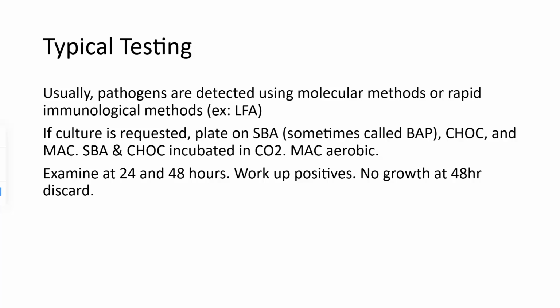The sheep blood agar and chocolate agar are incubated in CO2, and MacConkey is incubated aerobically. You want to examine plates at 24 and 48 hours. You work up any positives, especially if you see those alpha hemolytic ones, you want to work those up. No growth at 48 hours, you can throw out the plate.